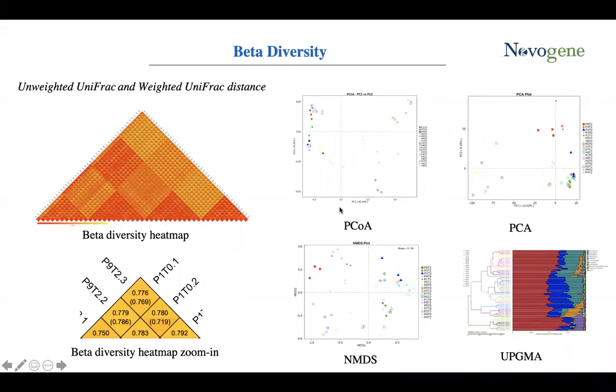And principal coordinate analysis, which is the PCoA, is an ordination technique which picks up the main elements and structures from reduced multidimensional data series of eigenvalues and eigenvectors. The technique has the advantage over PCA that each ecological distance can be investigated. Also, weighted UniFrac and unweighted UniFrac are calculated to assist this PCoA analysis.